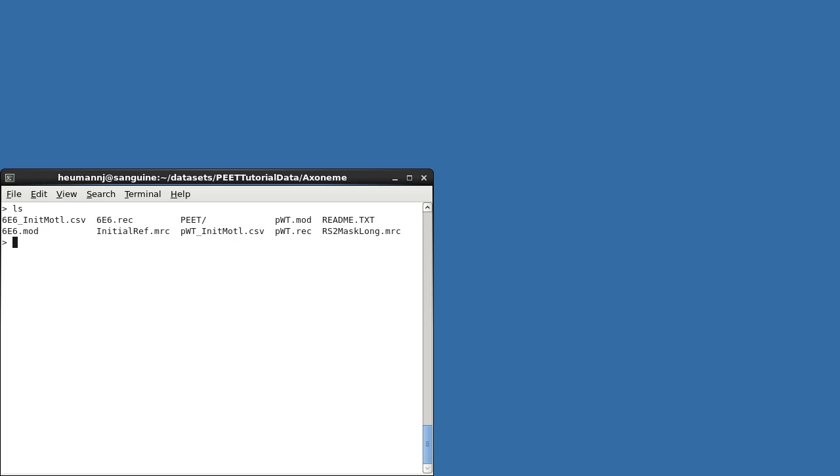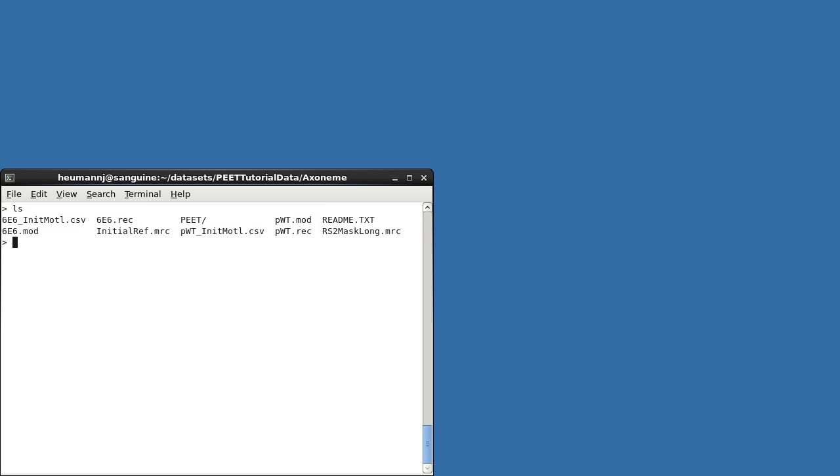In the tutorial's top-level directory, you can see that we have two volumes with associated models and initial motive lists, labeled PWT and 6E6. The PWT data are from a pseudo-wild-type revertant strain, which is functionally and structurally normal. The 6E6 data are from a mutant with slightly impaired mobility and structural defects in the flagella.